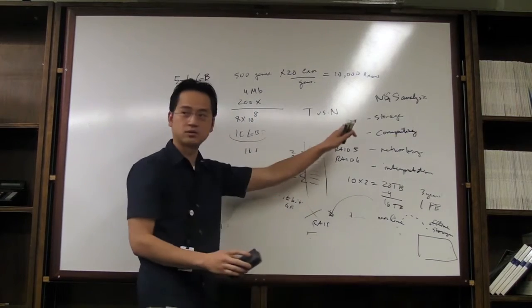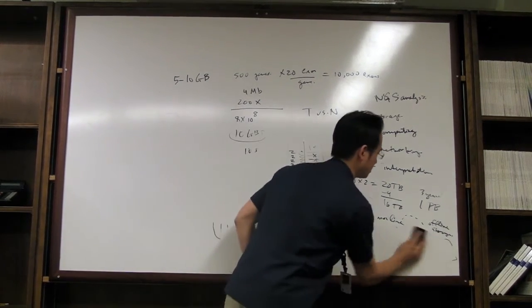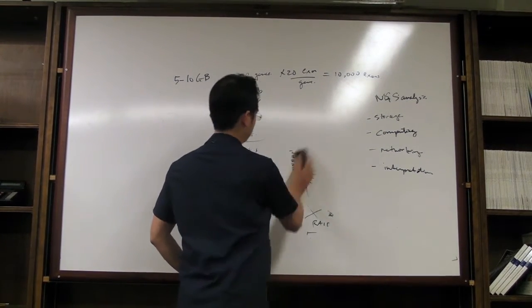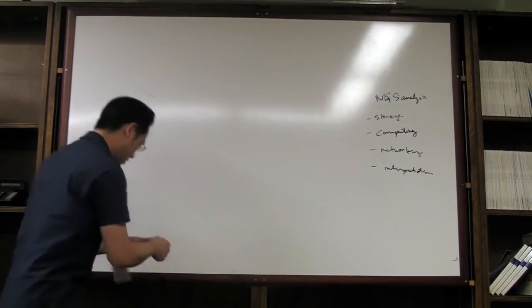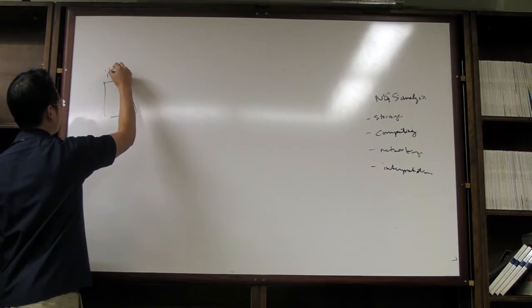And you guys understand why it's such a beast to deal with? So we get back that 10 gigabytes of data. Originally, let's just say it's an Illumina run, right?